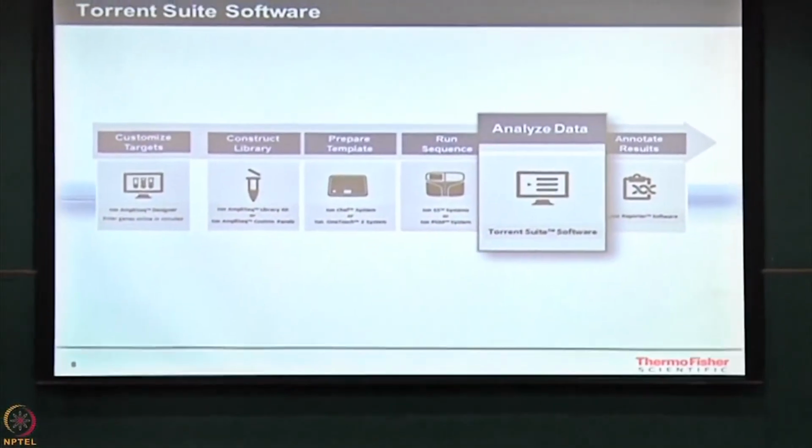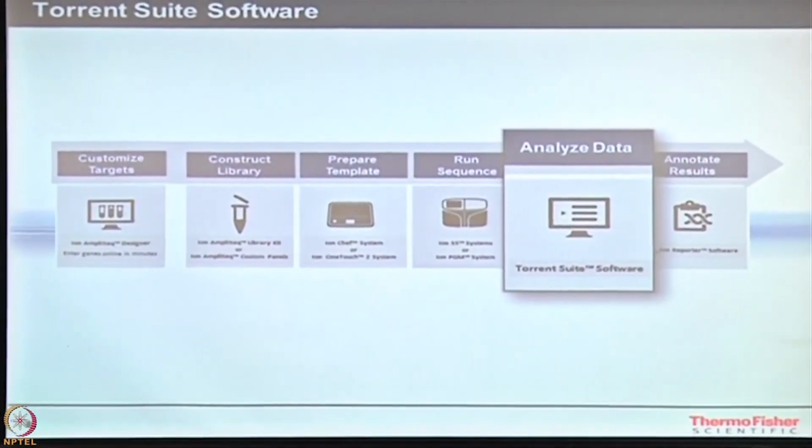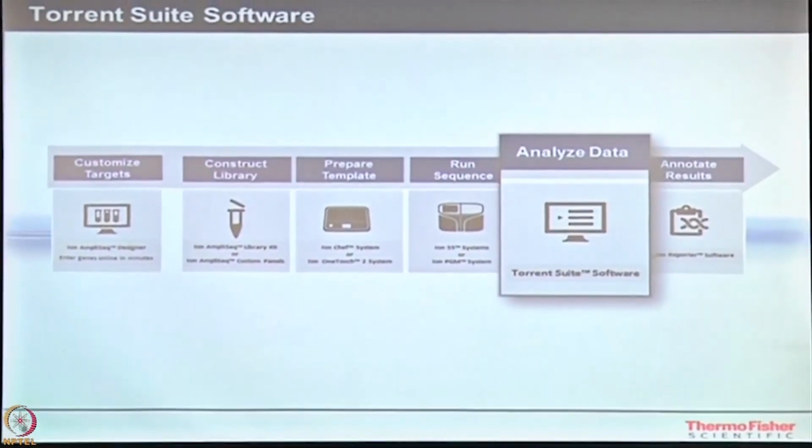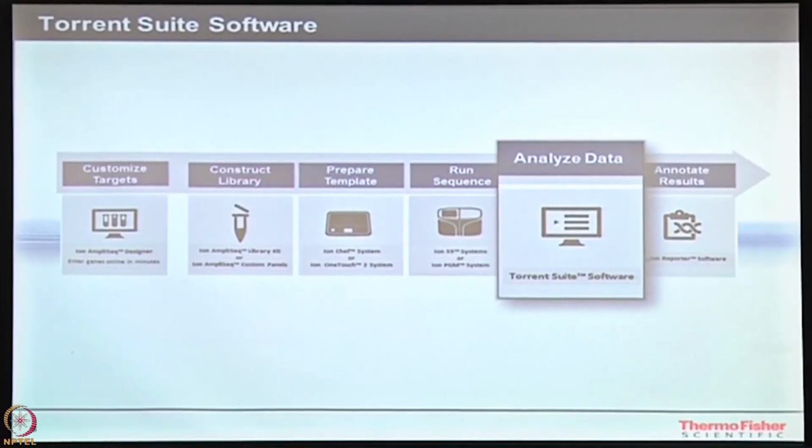Okay, I have not put much into this. I'll just take it to the specific level of analysis that we do. So once the system internally does the alignment with a reference genome, say you are running a particular BRCA sample and you do a run and you have a reference human genome, you align it. You like to know what is happening behind it, right? Your data is getting properly aligned to it. But how much of the data is getting aligned to it, right? That would be your first question. So if I have generated around 2 million reads for that sample, how many reads are actually aligning to those regions which are of interest to you, right?